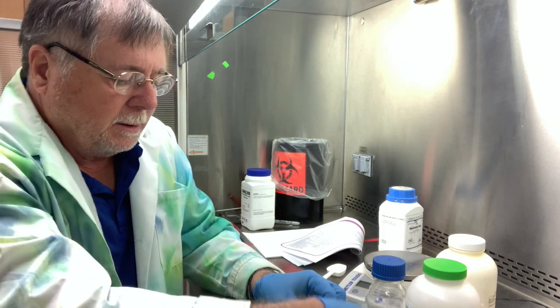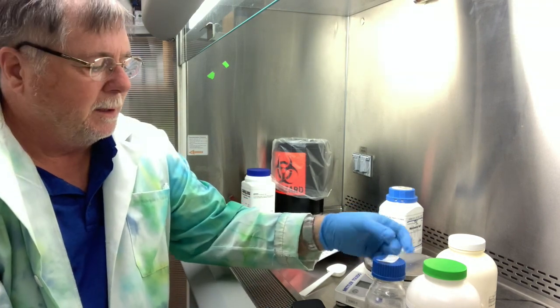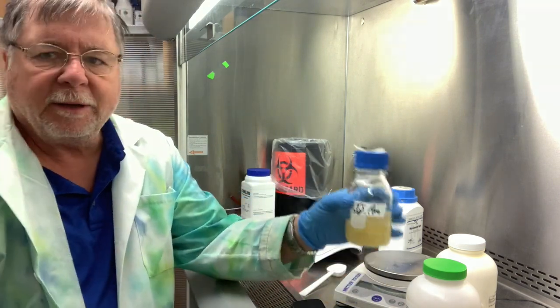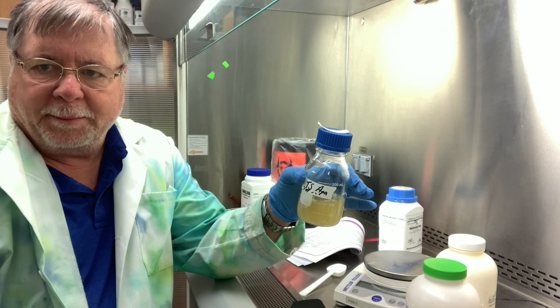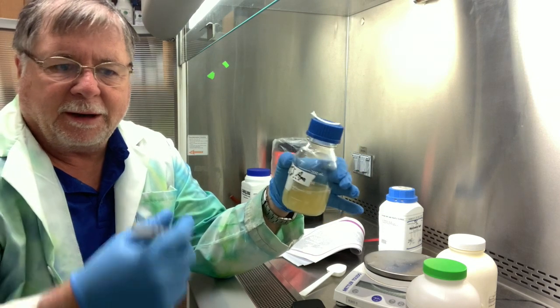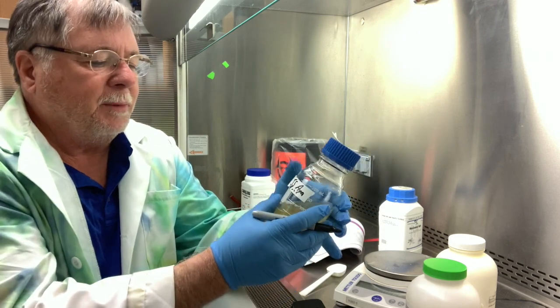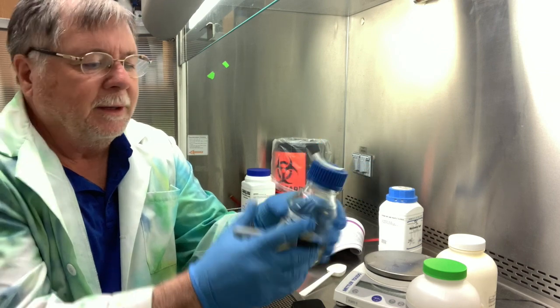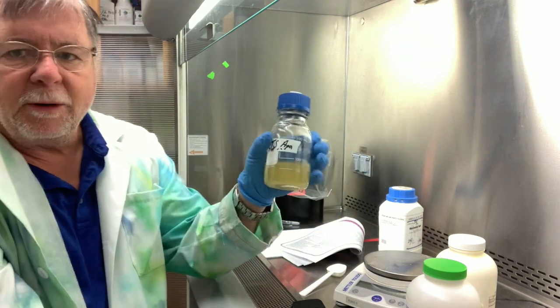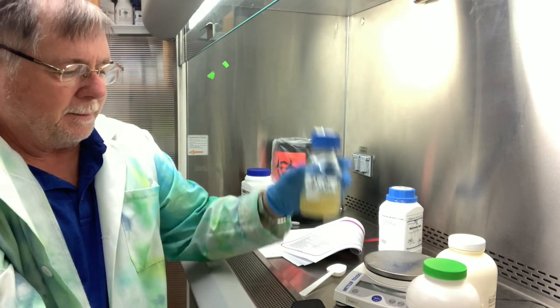Okay, and then here's the autoclave tape. We'll put that on, and we don't need very much. It just goes on top of the lid. Okay, and then the lid has to be loose. If you tighten it too much, and when you put this into the autoclave, this will overpressurize and blow up. And the worst thing is that it would blow up after it's autoclaved. It gets really hot and pressurized, and then you take it out of the autoclave, and then you get this blown up all over you, and it can be very serious. Okay, so you want to make sure this is loose so that it can vent the pressure. All right, and so this will go into an autoclave, and the autoclave will do its work on it, and then when we're done.